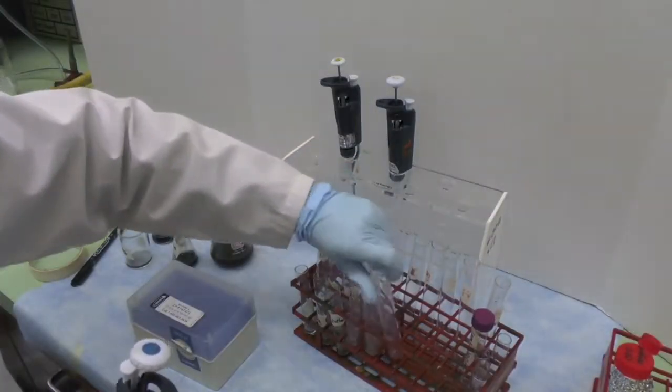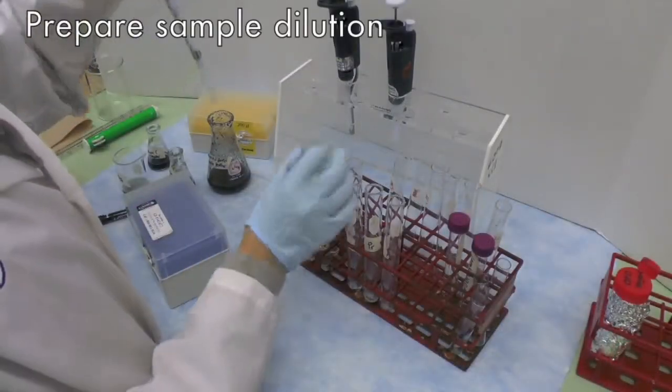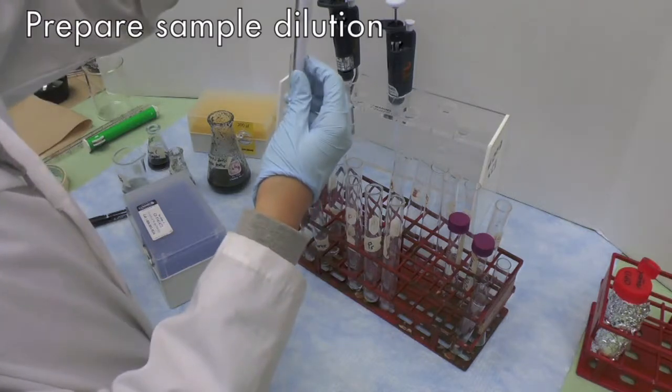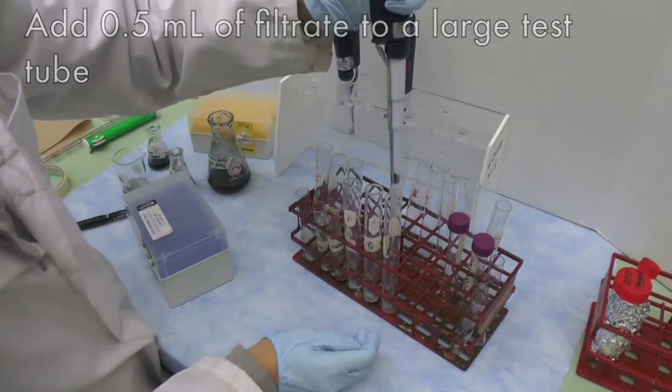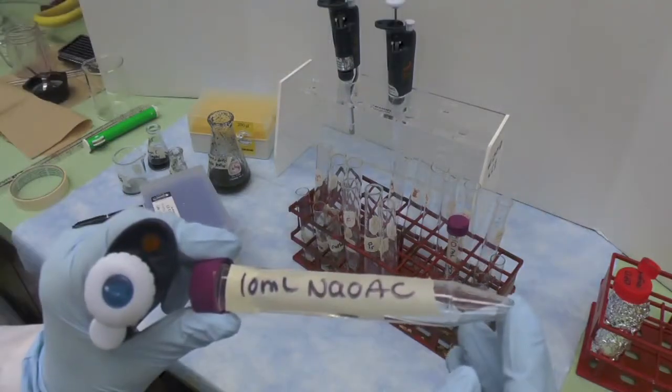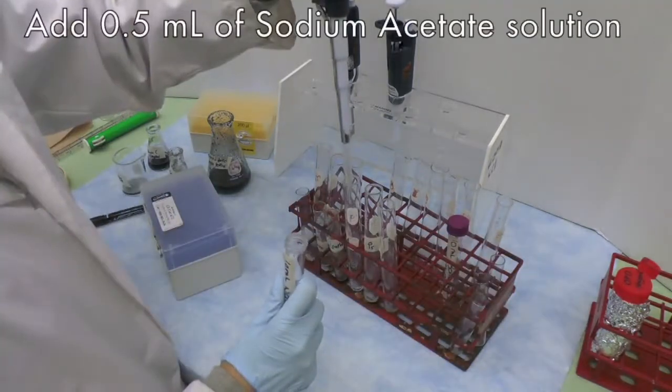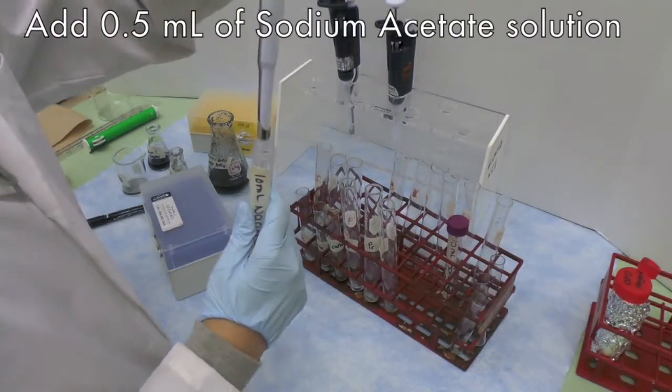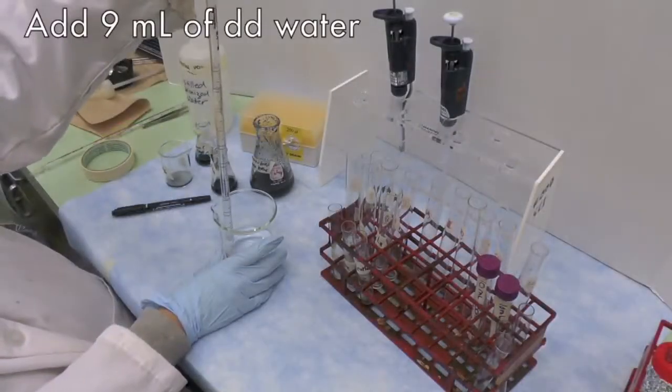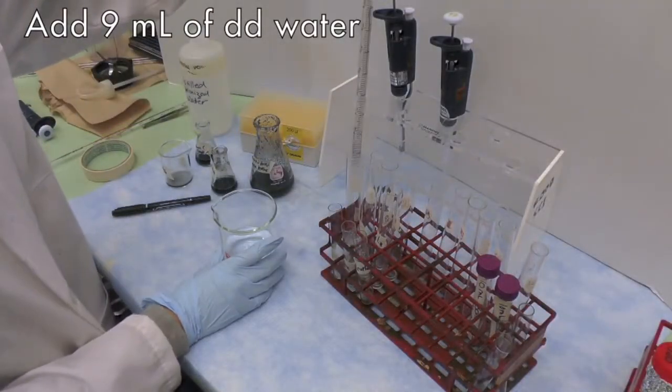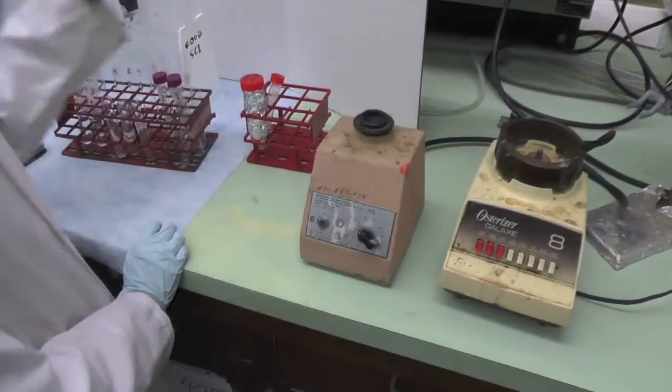Meanwhile, prepare the standard dilution or sample dilution by transferring 0.50 ml of each filtrate into a separate large test tube. Label clearly to differentiate your samples. Add 0.50 ml of sodium acetate solution into each large test tube along with 9.0 ml of dd water. Vortex the large test tubes.